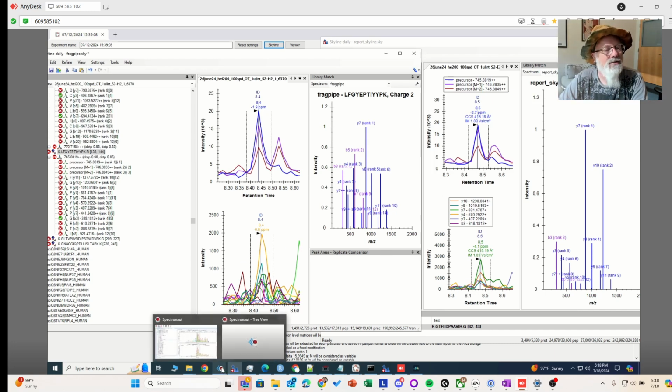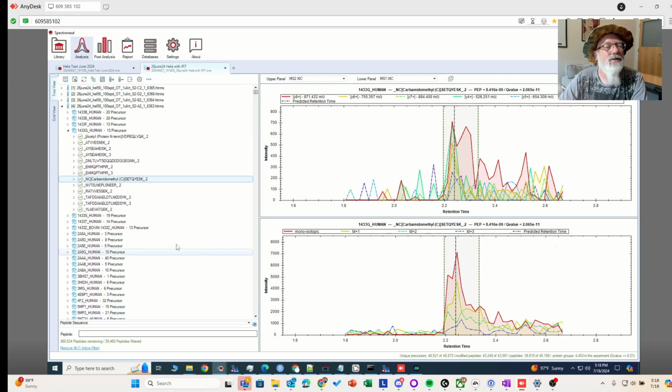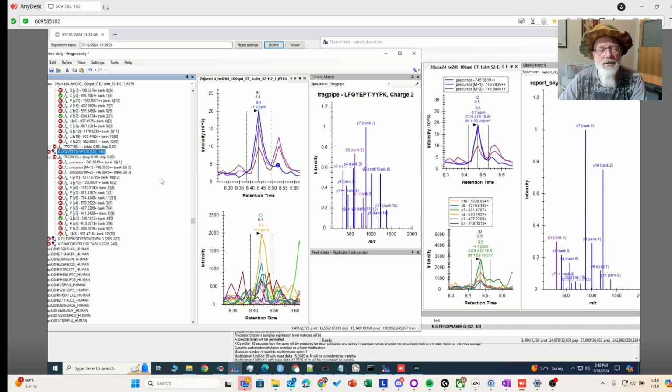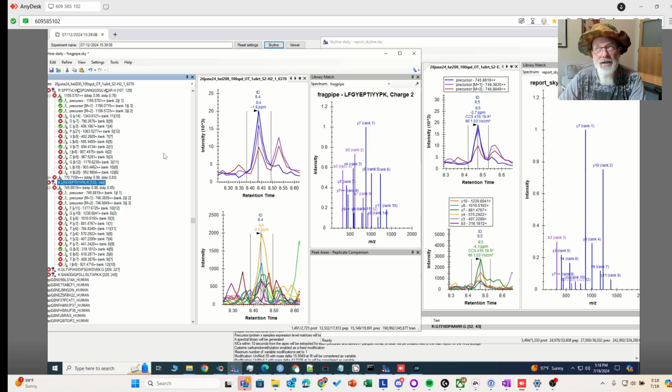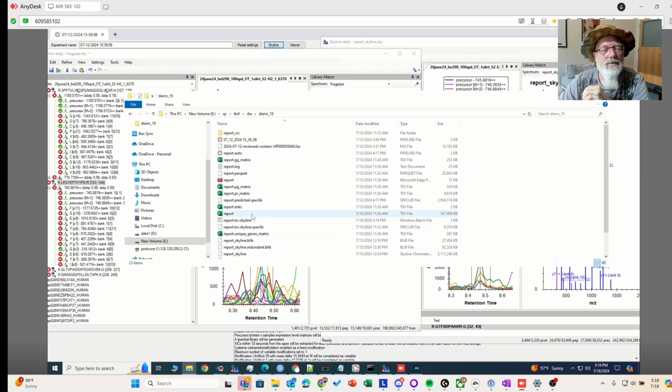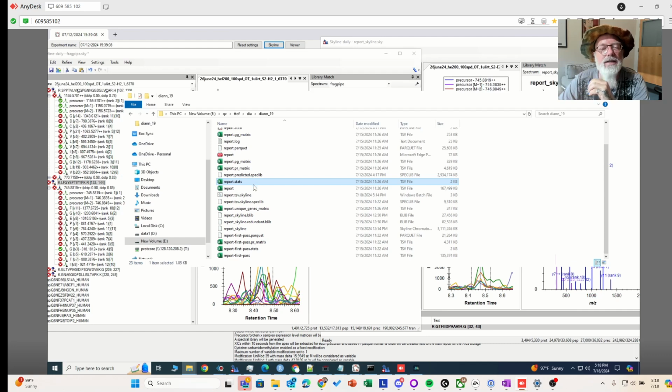I believe I also have Spectronaut results for this. Oh, let's look at, so remember in the Skyline video, the FragPipe, diaTracer, DIA-NN implementation identified around 2,800 proteins. Let's see what the DIA-NN identified.